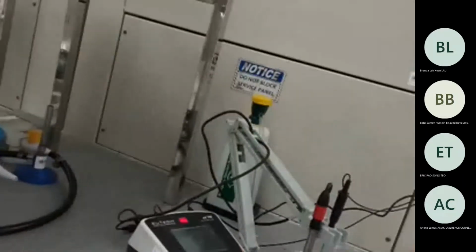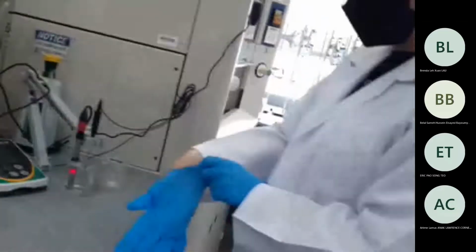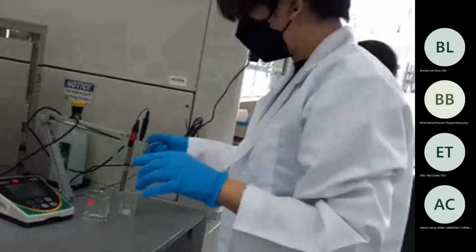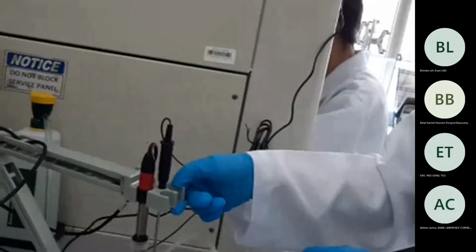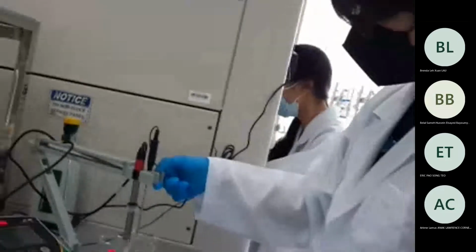And then you put it there, 3.3. Just rinse your thing here also, because we are going to throw it anyway. Okay, enough. Just go and bring the second one faster.